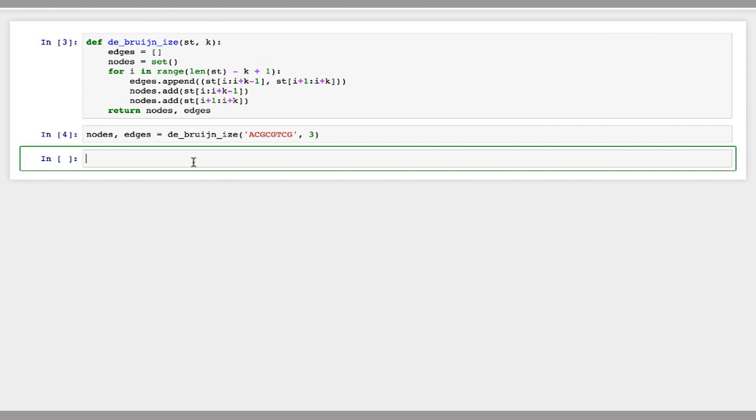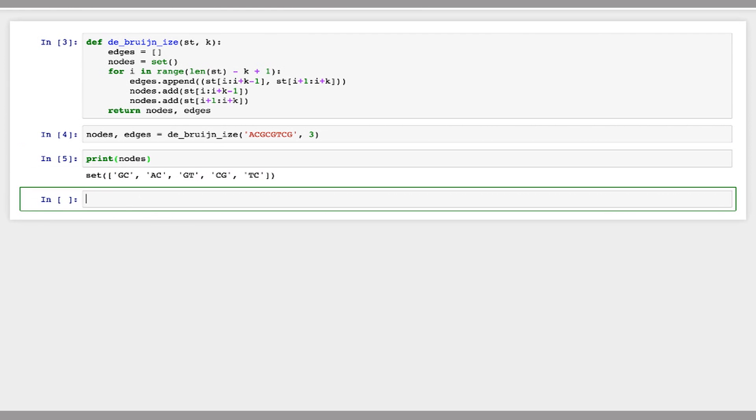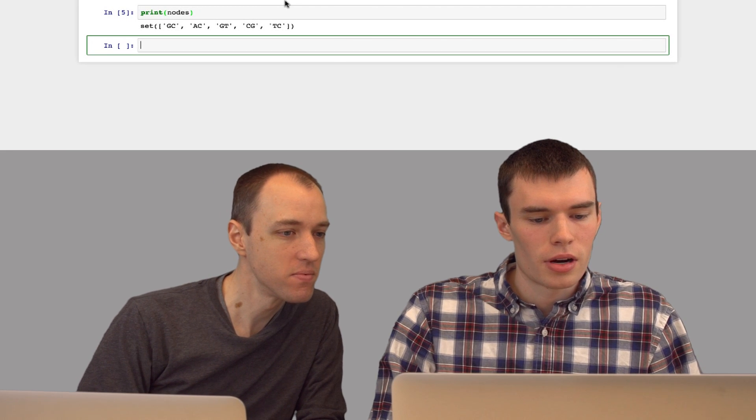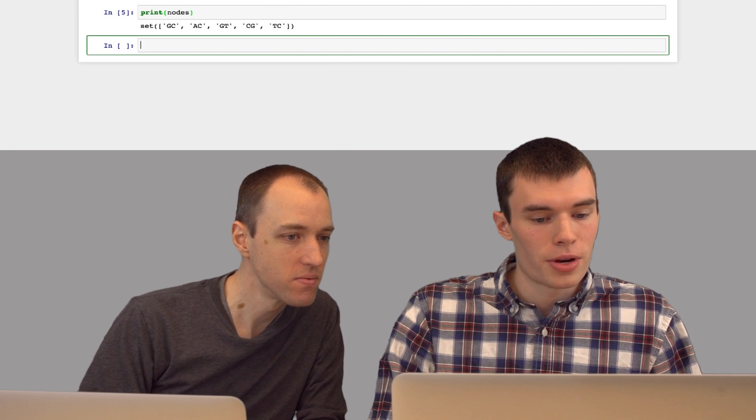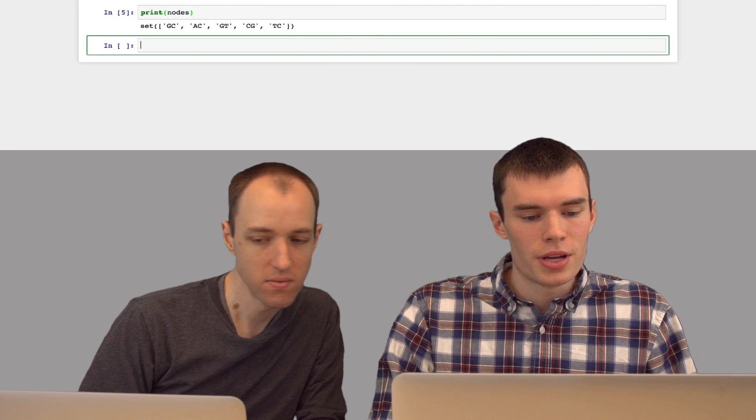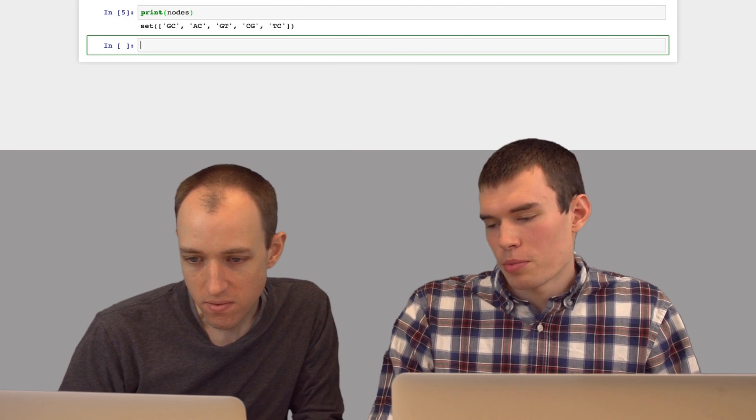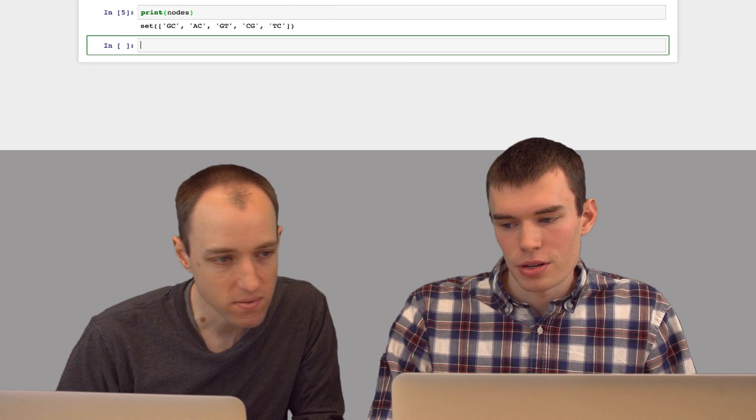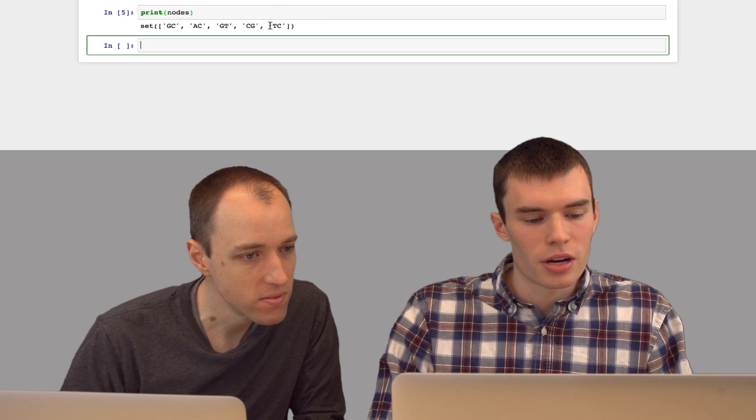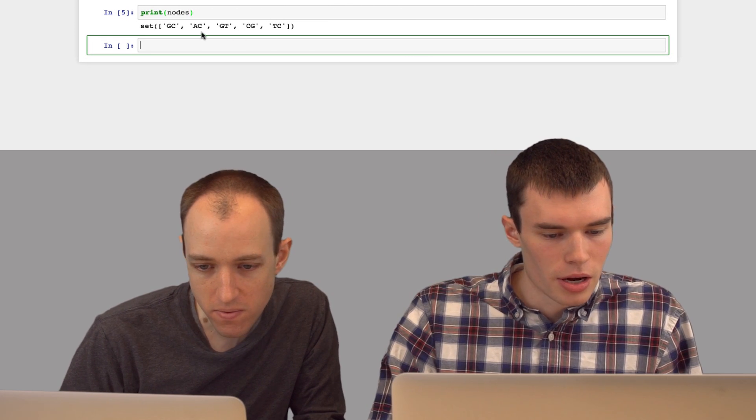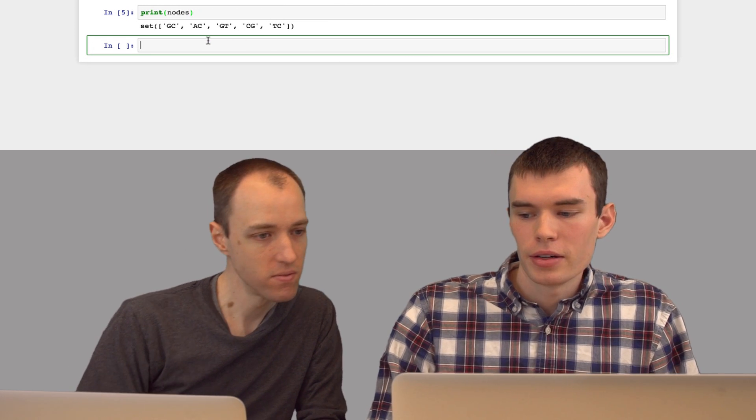Now let's print out our set of nodes. Okay. We've got AC. We've got CG. We've got GC. We've got GT. Looks like we've got all of them. Yeah. And so since our kmer length is 3, every k-1mer in this string should appear in our set of nodes. And it looks like they're all there.